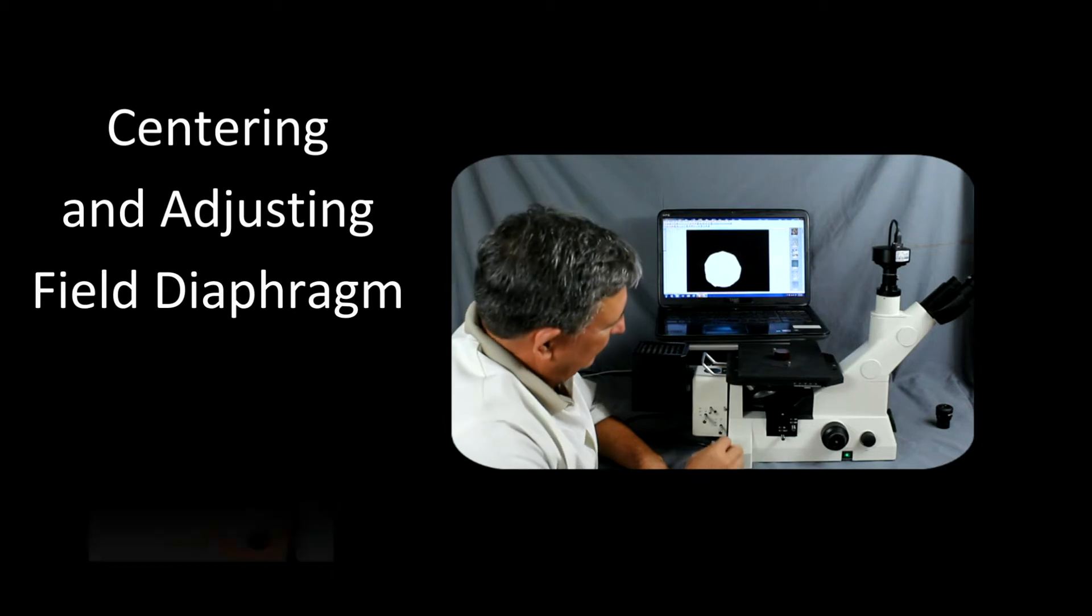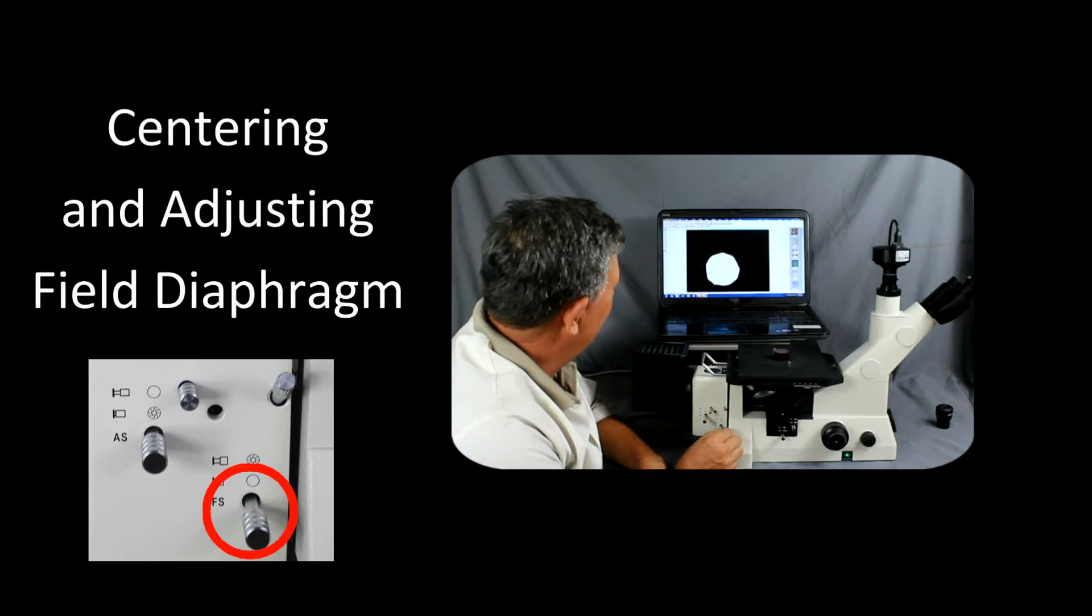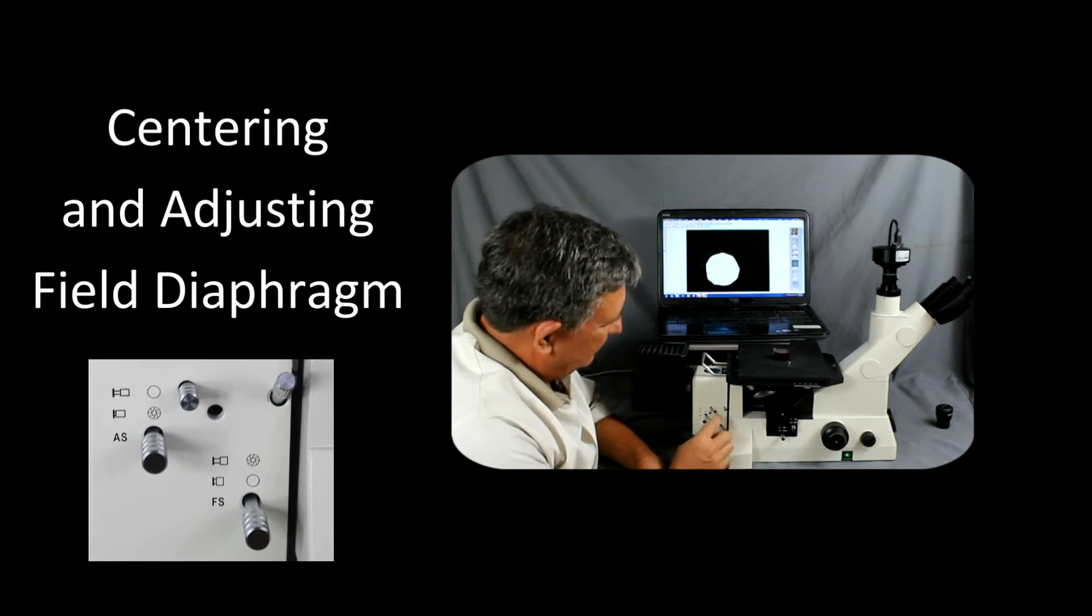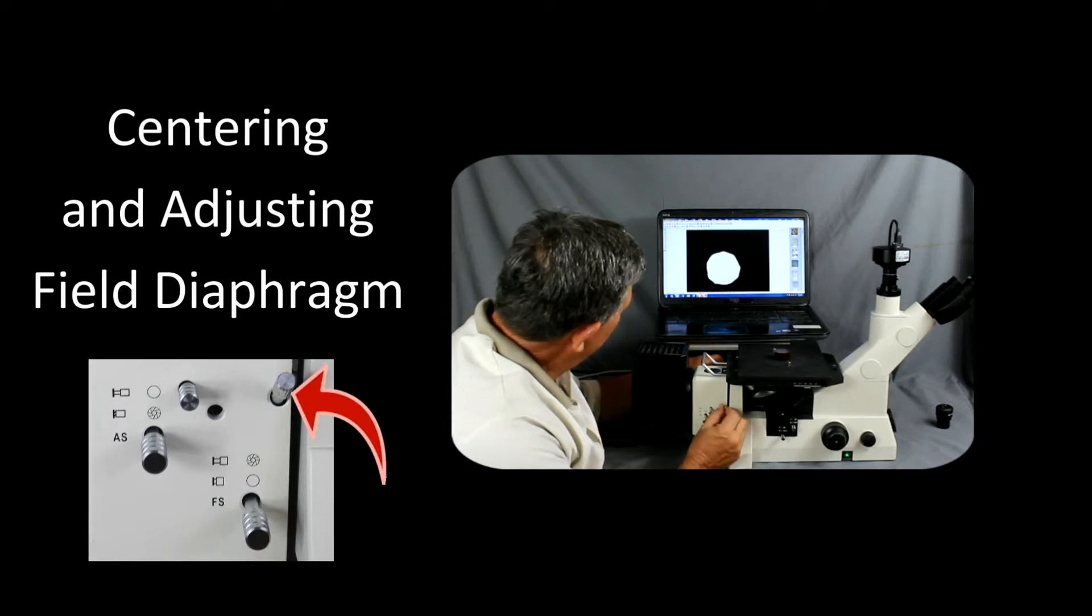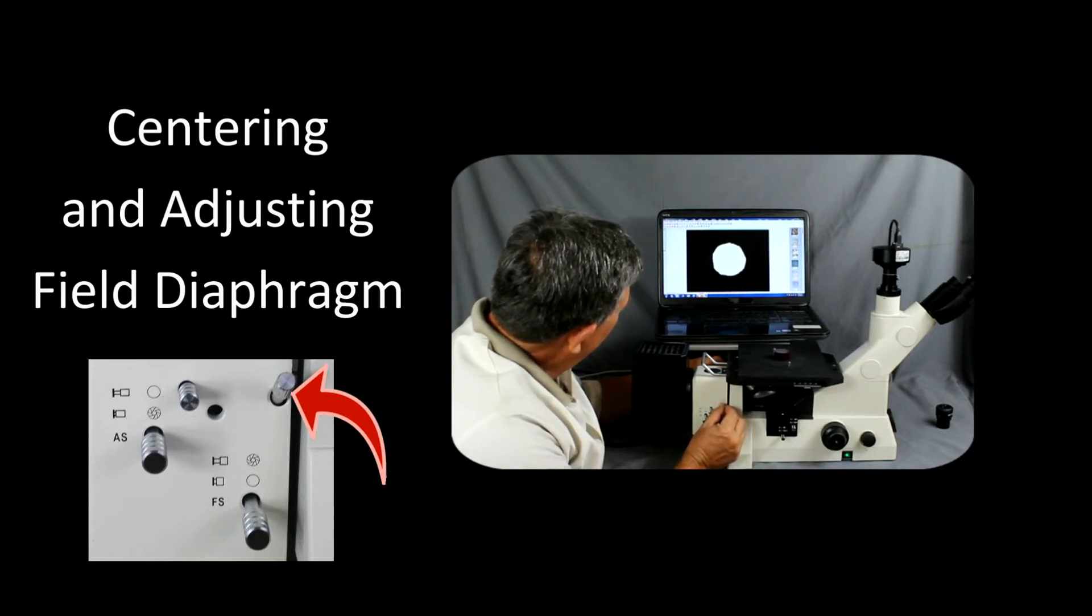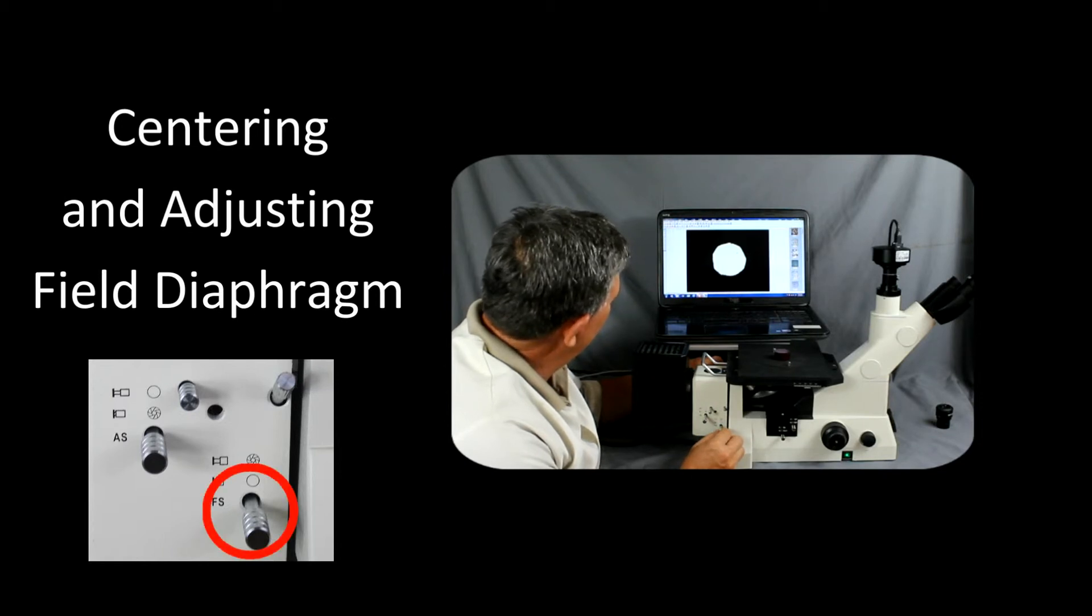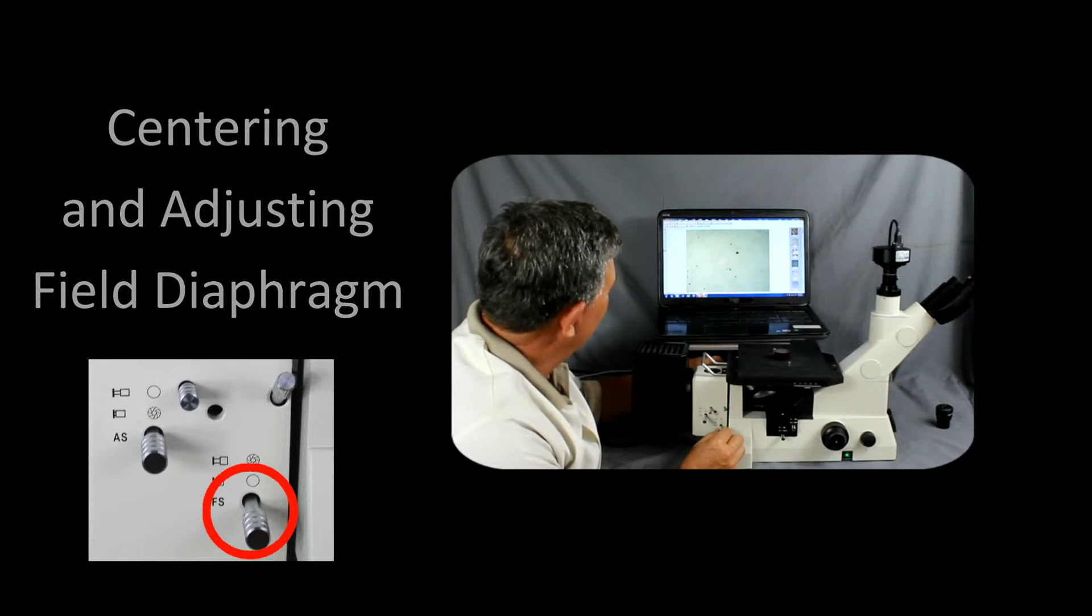Adjusting the field diaphragm. By pulling out this lever here, we can reduce the iris on the field diaphragm. Once we have that reduced, we can now center it. So there's a knob here and a knob here. So let's go ahead and turn these until we have it centered. And after we have it centered, what we want to do is we want to push the lever back in so that we're just outside the field of view. This will reduce any stray light within the system.